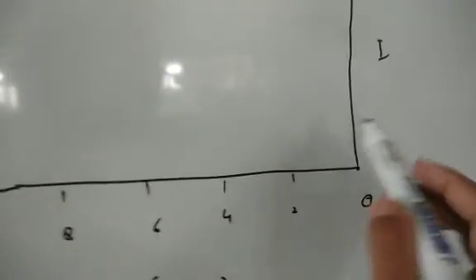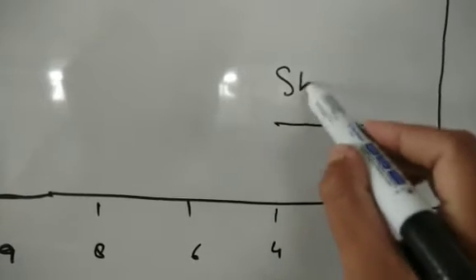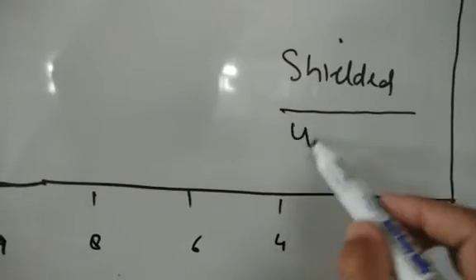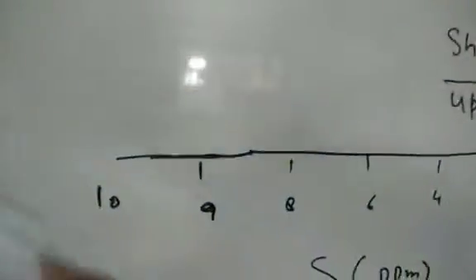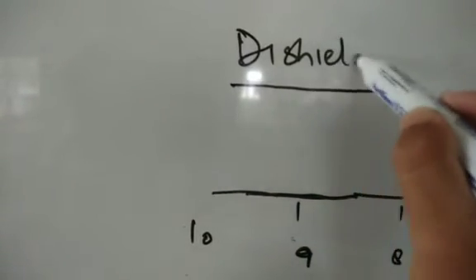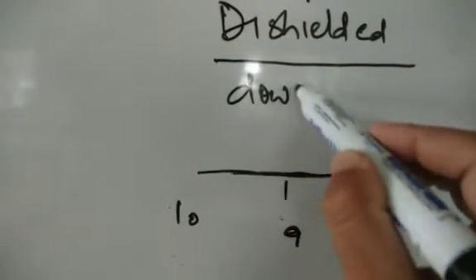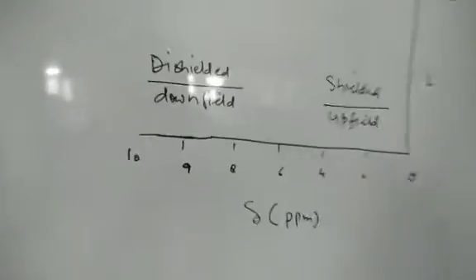फिर मैंने बोला था अगर पीक इस एरिया में आता है around 3, 4, this is called as shielding region, shielded peak. And this is also called as upfield condition. Upfield. But ये वाला region is 6, 7, 8, 9, 10 ये वाले side में. So in general we call this as deshielded. It's called downfield condition. So upfield and downfield condition.